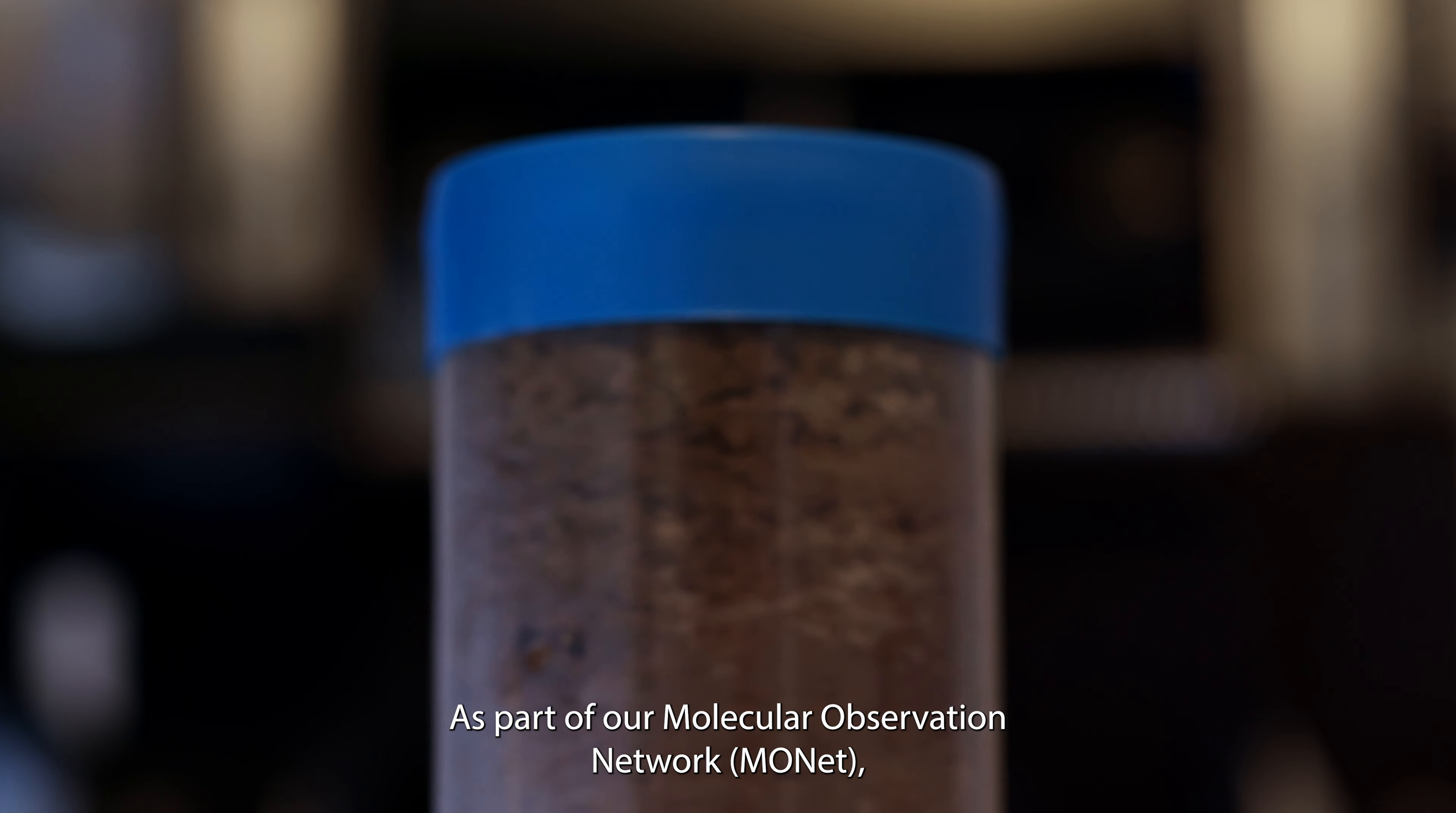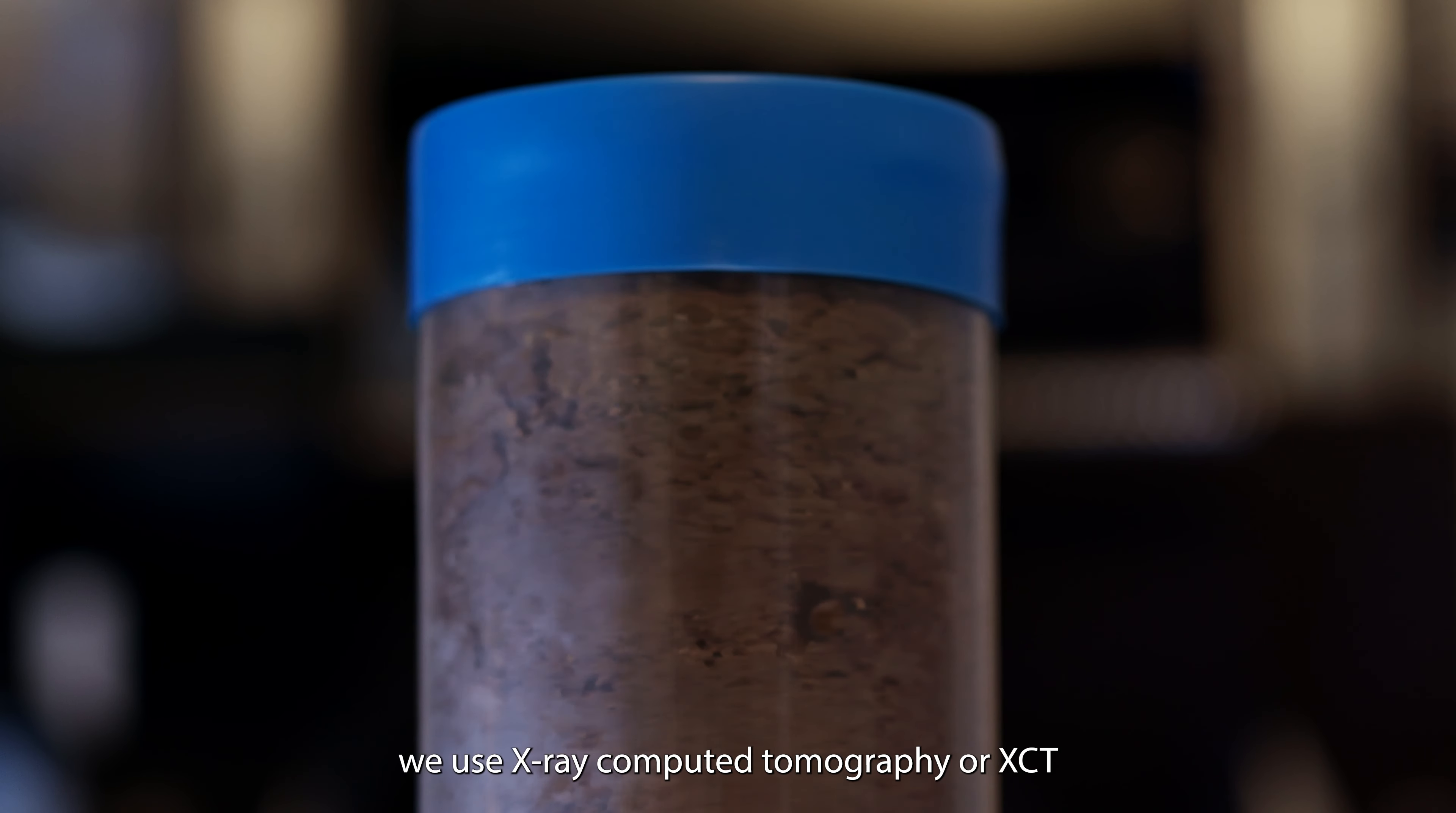As part of our Molecular Observation Network, we use X-ray Computed Tomography, or XCT, to look at soil structure.